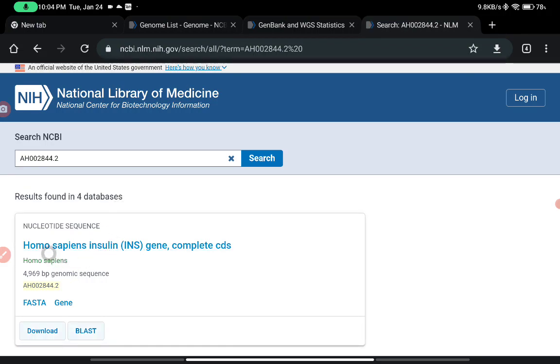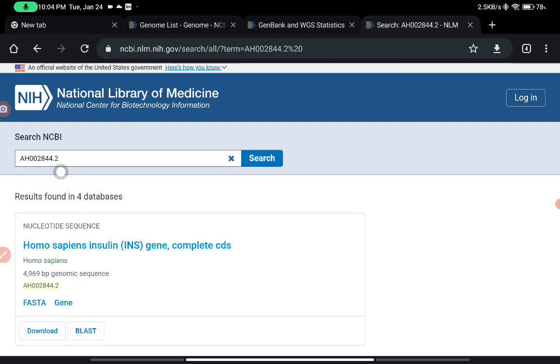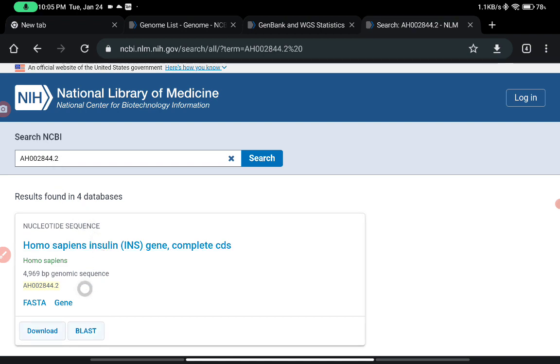Here you can easily see it is showing Homo sapiens insulin INS gene complete sequence. You can also see the version number — '.2' means two modifications have been made. We will now go for the FASTA sequence.